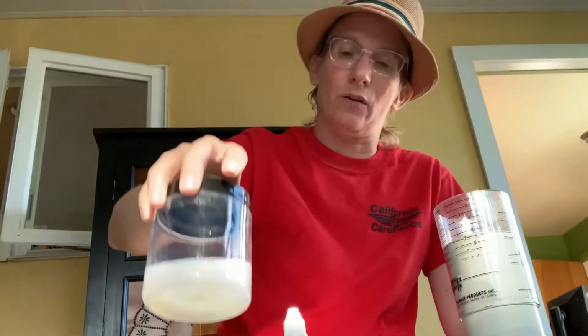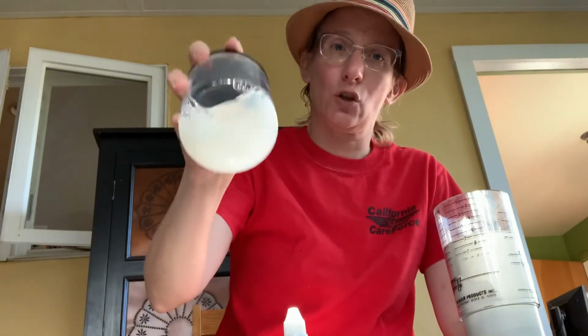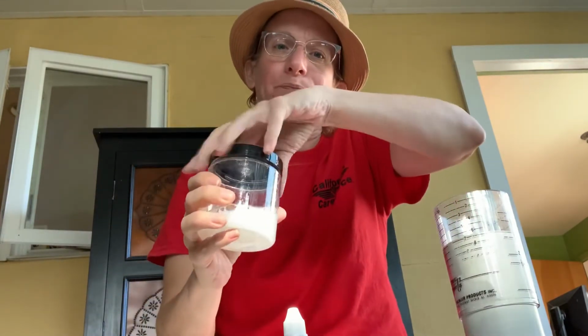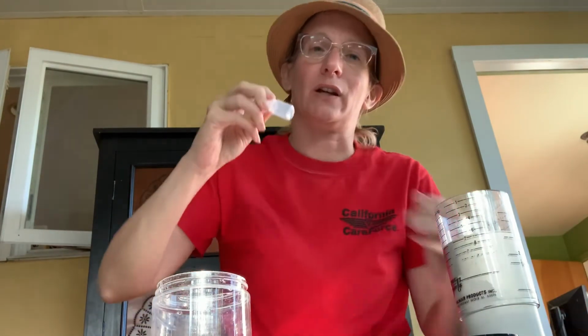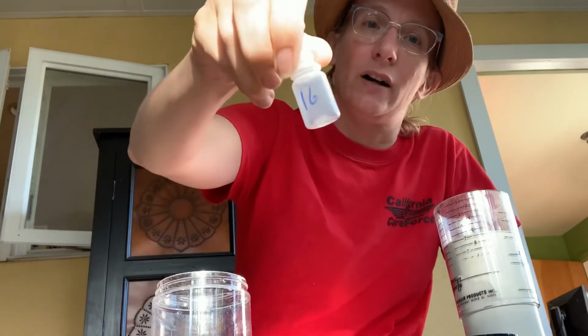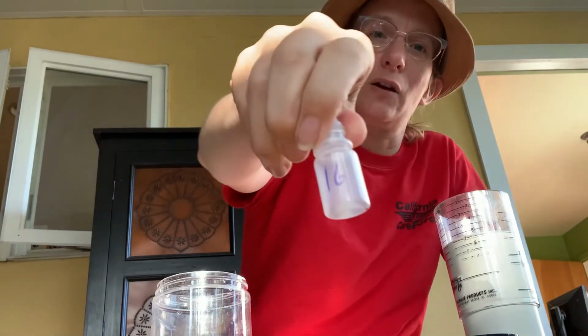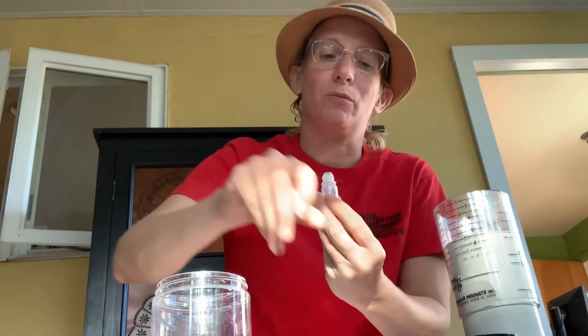Okay, now very important, you're not going to use this full 100 milliliters. That's too much and it won't work for the test. So what you're going to do is open it up and put it in a small container. I happen to have these nice little containers that Kendall gave me for something else. These actually hold 5 milliliters completely, and what I did is I wrote the hive number on them so that I could keep track of which was which.